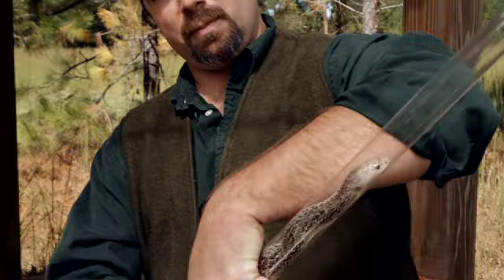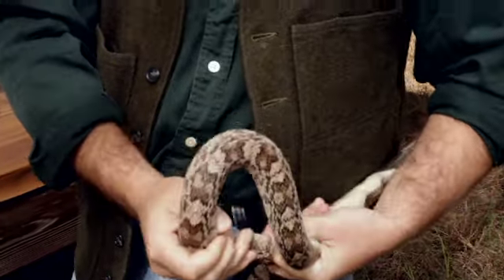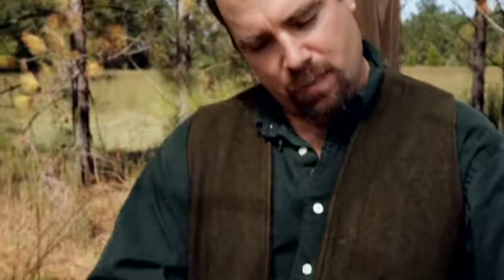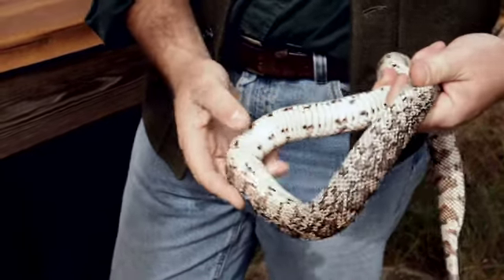There are two places that people usually implant pit tags. Oftentimes people will implant them between the skin and the rib cage on the side of the animal. I typically don't like to do that because I worry about the snake moving through the environment and that catching on things and eventually tearing out of the side. So I typically put them inside the gut, or what we call the peritoneal cavity of the snake.